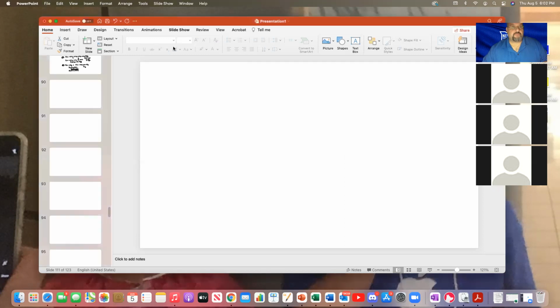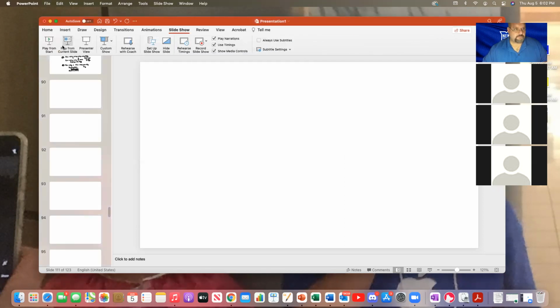So since with the benzoic acid there was no color change, that means it's not allowing the enzyme to work? Yeah, exactly. If the enzyme was really working, you would have a brown color in the solution. But if you have no color change, then it means the enzyme is not working. So in theory the tyrosinase should work with the catechol, but it's not, and the question becomes, why? In that case, the benzoic acid is the contributing factor.